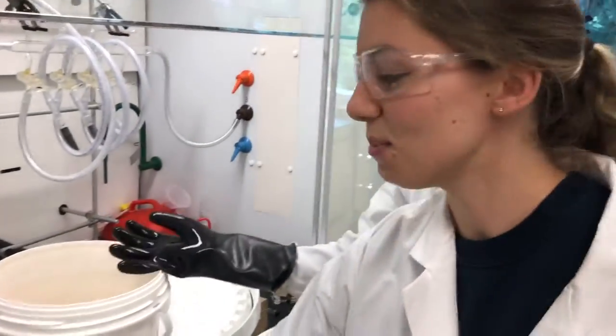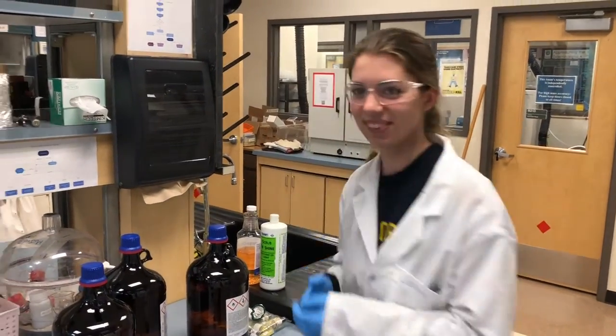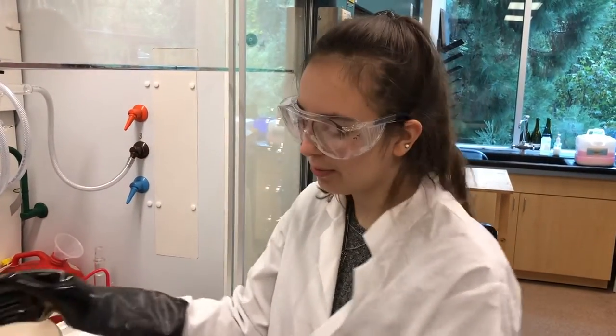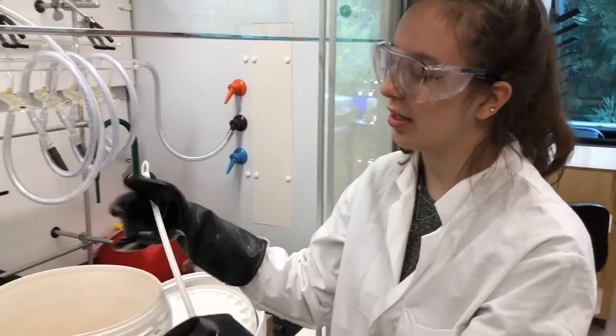And then we can take these to be washed — we'll do that later. Now before we remove the original base bath, we should check for any stir bars that were left behind using the magnet.